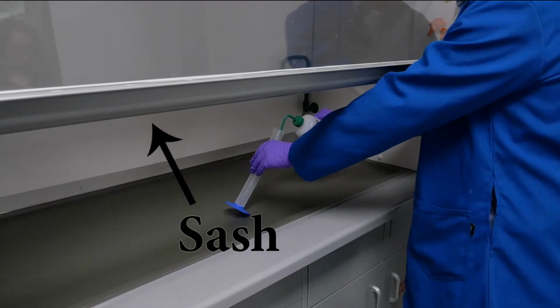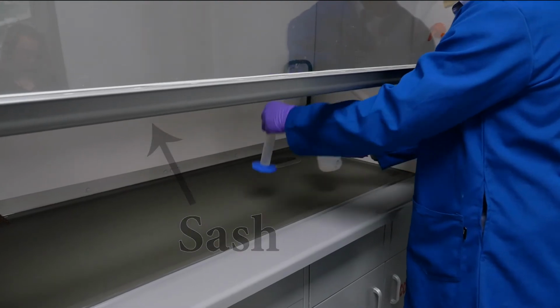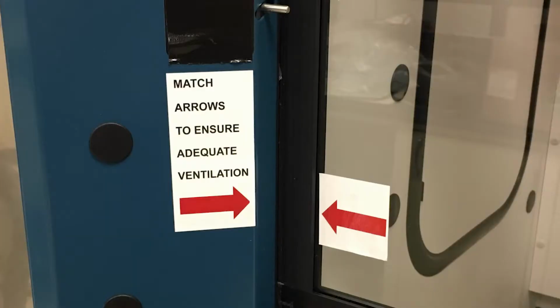The sash is another important safety feature of the fume hood. It acts like a shield if your reaction goes wrong or explodes, but it can only protect you if it's low. Keep the sash down in front of your face and chest as you work. A lower sash will also help to capture vapors. So don't raise the sash above the arrows to ensure chemicals stay in the hood and not in your face.